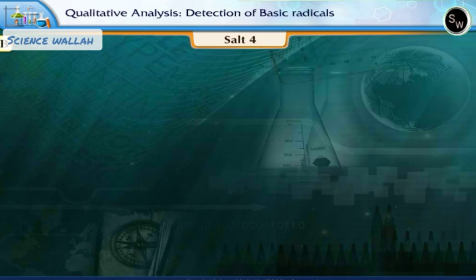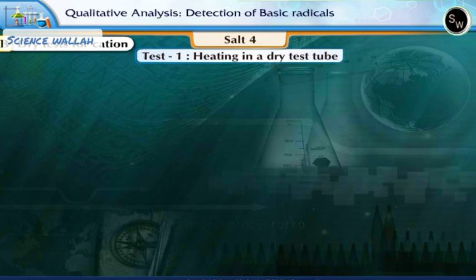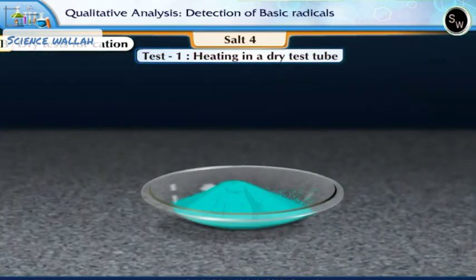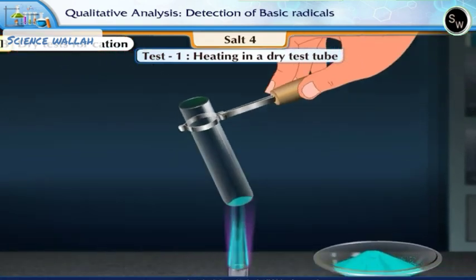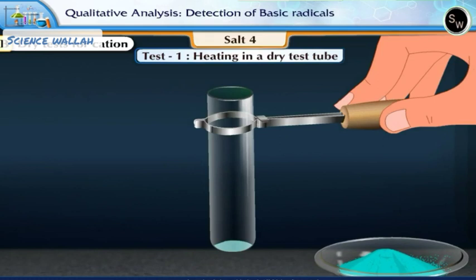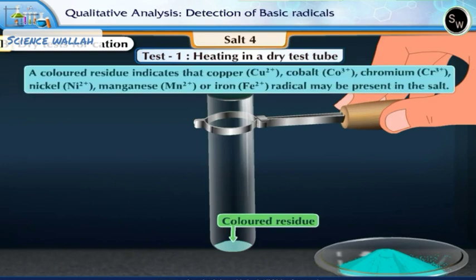Let us now perform the dry test for cations. Test 1: Heating in a dry test tube. Take a small quantity of the given salt in a dry test tube and heat it. Observe the changes taking place. There is a colored residue at the bottom of the test tube. The colored residue indicates that copper, cobalt, chromium, nickel, manganese or iron radical may be present in the salt.